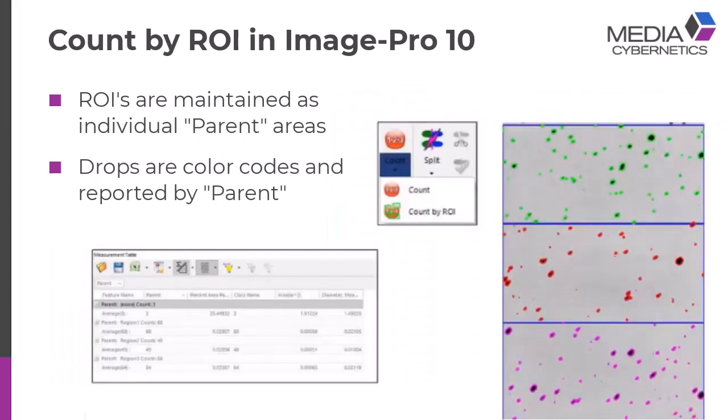With ImagePro10, count by ROI, we added a new feature under the count. The whole idea behind count by ROI was that you could have your regions, your ROIs set up, as many as you need. And then when you count by ROI, it would maintain these parent regions, and we would report the data per region, which is what you're seeing here. And it would also be color-coded by region. The data table would correctly report all of that data per region now, or per parent.